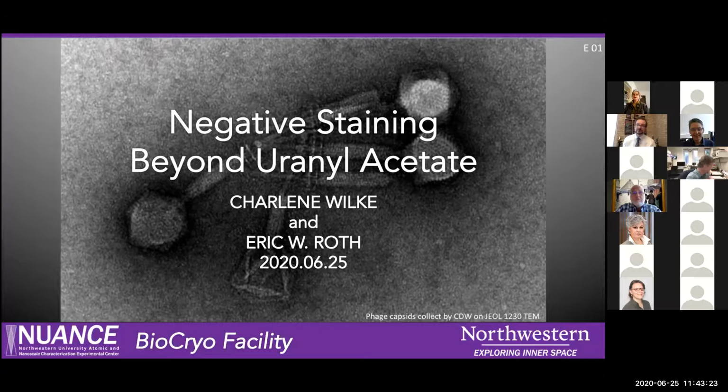As for excess dry, like the crystals, I'm just going to see if Jessica clarified anything. No, okay. I think that you'd want to go through research safety, and if it's excess containers of it, they should have a way to do waste. We've had a lot of changes in the way research safety has been addressing uranyl acetate, uranyl formate. Just in the last 6 months or so, they've changed everything on us. Over the past 10 years, they change it all the time, right? Yeah, that's true.